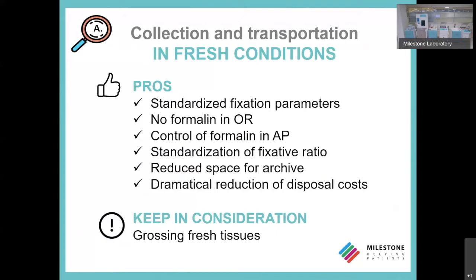We had some users for which the hospital administration banned the use of formalin in the operating room. So for the pathology department, there was no choice other than to use this type of delivery, in fresh condition. The control of formalin fixation will happen in the pathology department. So the pathologist will have the possibility to receive the specimen fresh, do whatever they want to do for the molecular analysis, and control and standardize exactly the formalin fixation time.